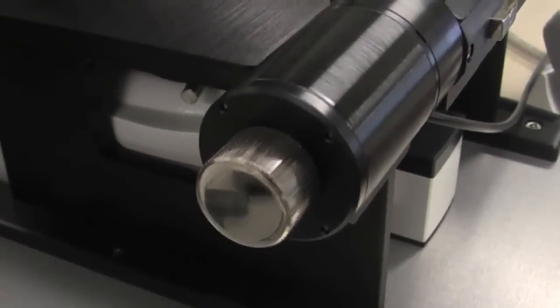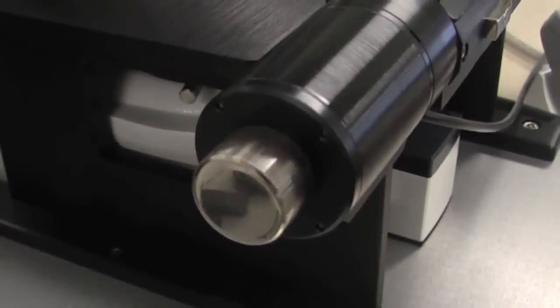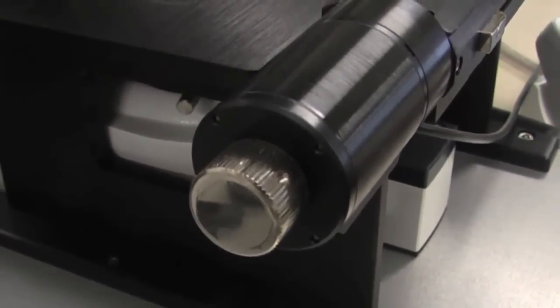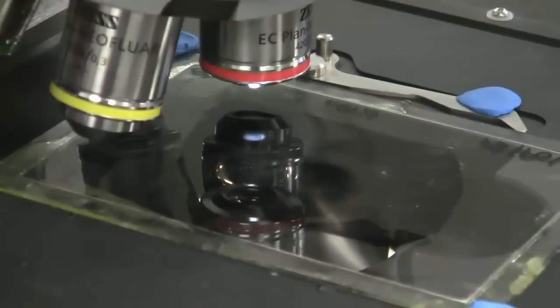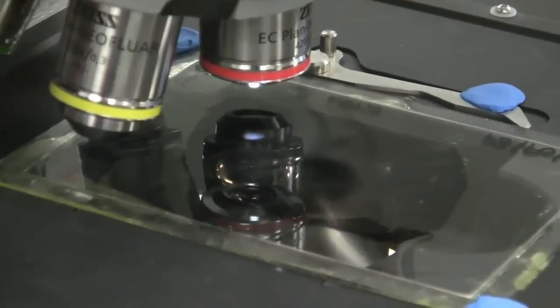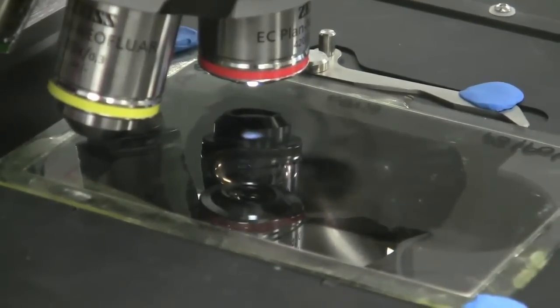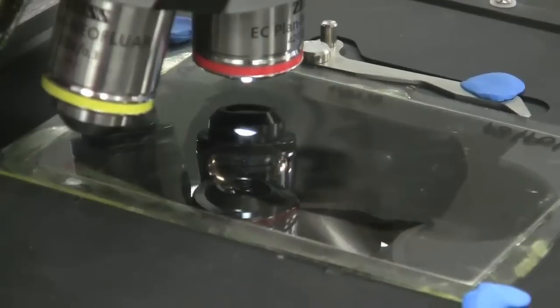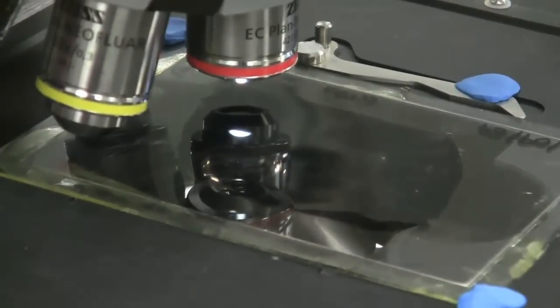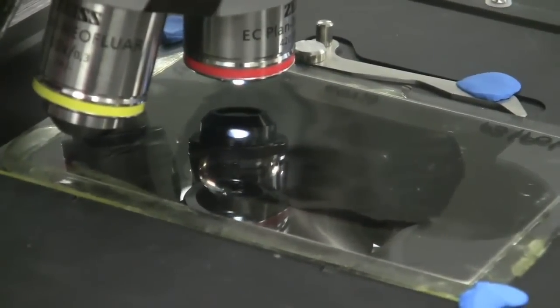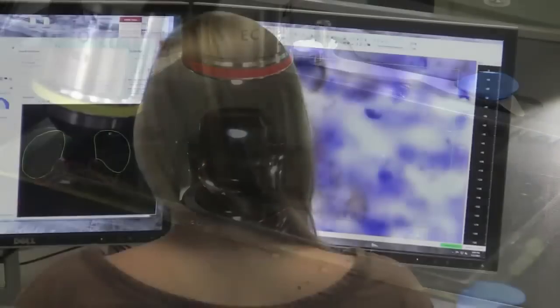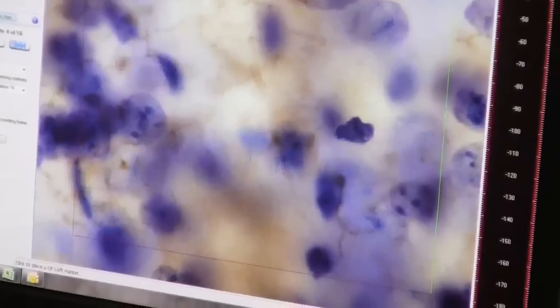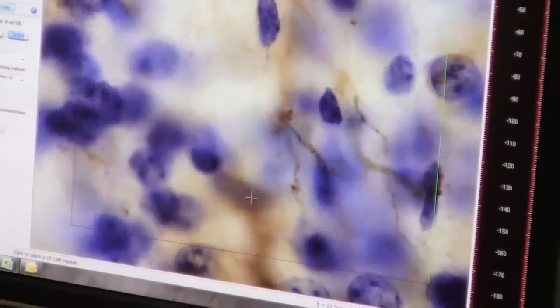StereoInvestigator is also capable of fully controlling numerous models of motorized XY stages, motorized focus systems, motorized filter wheels, shutters, LED illumination devices, and a wide variety of digital cameras at their full resolution.